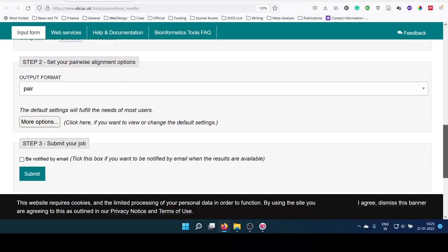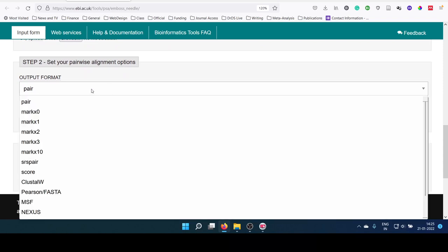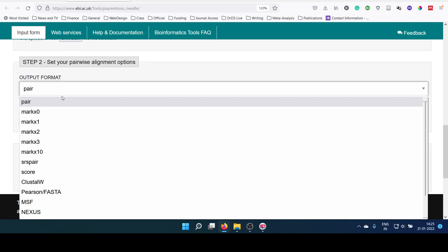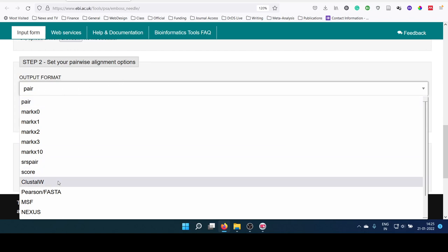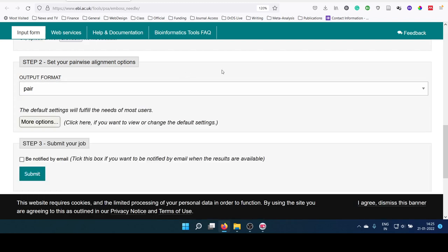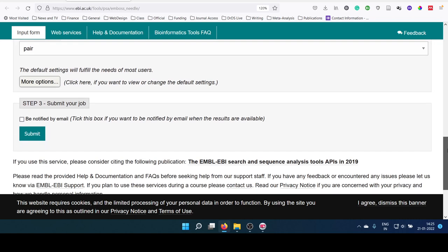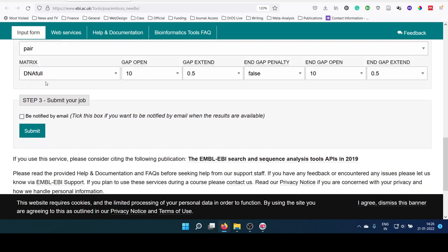Now set up your pairwise alignment options. There are different options now, output format pair or ClustalW, something any option can be selected. There are more options here: gap opening penalty, gap extension penalty can be modified if it is required, and finally, you can submit.